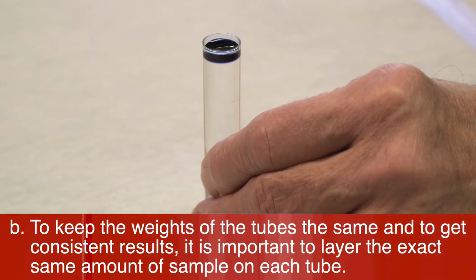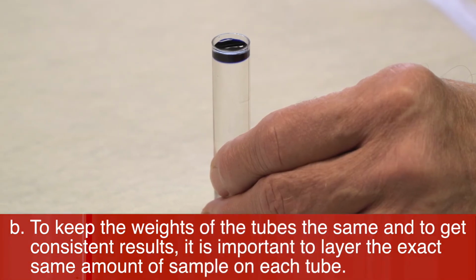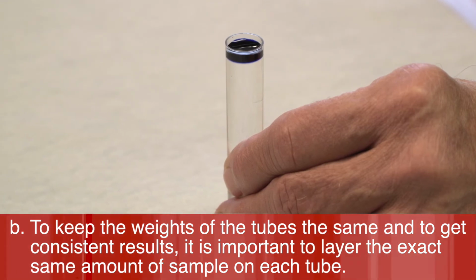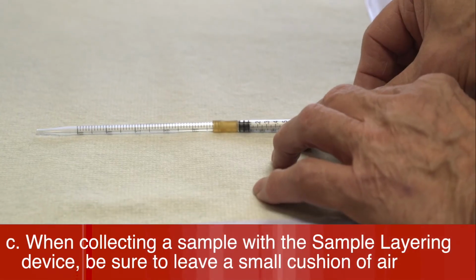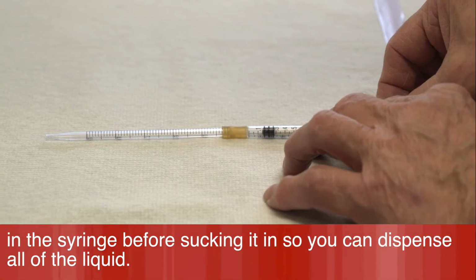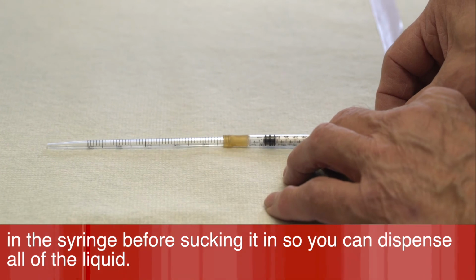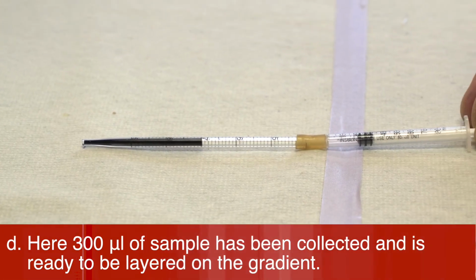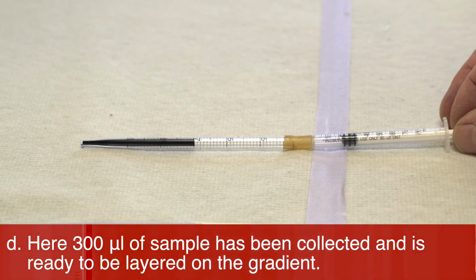To keep the weights of the tubes the same and to get consistent results, it is important to layer the exact same amount of sample on each tube. When collecting the sample with the sample layering device, be sure to leave a small cushion of air in the syringe before sucking it in so you can dispense all of the liquid. Here, 300 microliters of sample has been collected and is ready to be layered on the gradient.